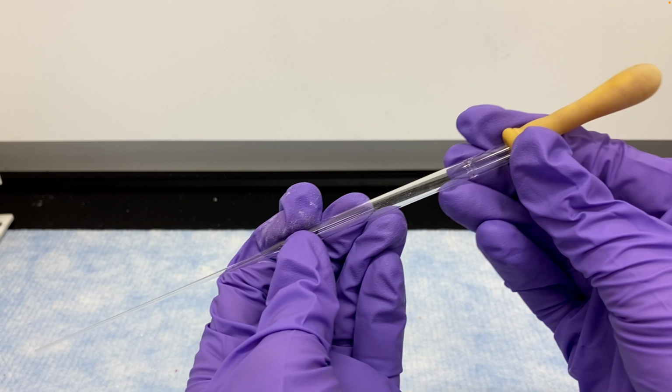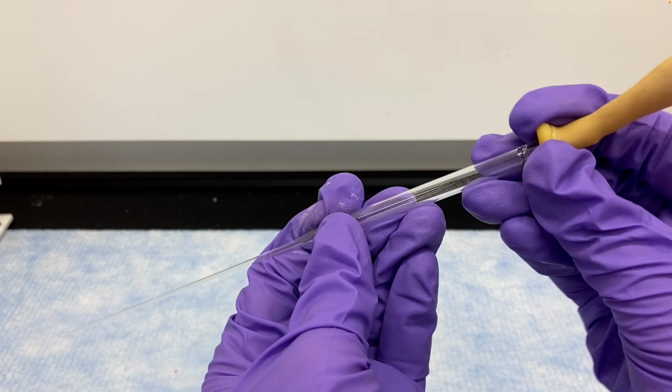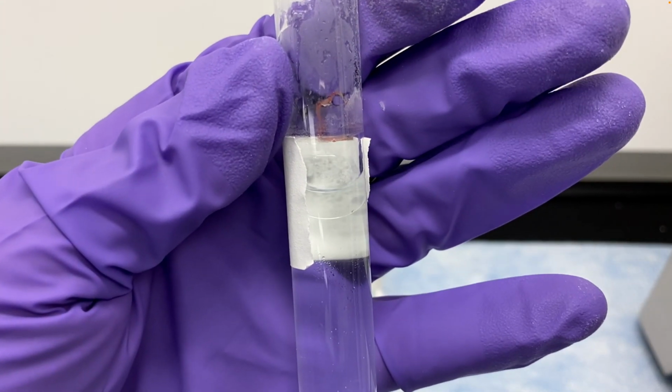So you'll take a Pasteur pipette. Notice the tip of this Pasteur pipette is really long. This is a 9-inch Pasteur pipette, whereas up until now you've been using a 5 3/4 inch Pasteur pipette. You'll attach the bulb to it, and what you'll do, you see the two layers there? The top layer is the ethyl acetate that has camphor in it, and the bottom layer is all the water with all of the junk that we put in it, sodium bisulfite and salt, etc.